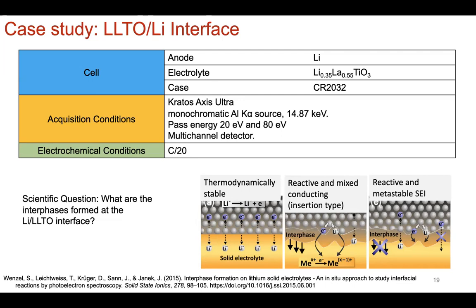It's actually not stable against lithium metal, but it is a really good model system to try to understand what's happening upon lithiation, delithiation, because you can probe the reduction states and the oxidative states of titanium during the cycling. So what's also really interesting about this study is that they're trying to ask the question, what exactly happens?